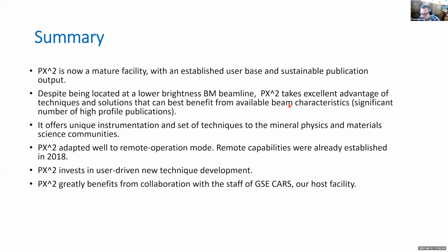It's a great challenge. So if we can reduce the beam size to say 5 microns, it's going to dramatically decrease the complexity of the analysis. This is what is now the case at insertion device experimental stations, and in every case when we produce these multi-grain samples, performing the experiment at Vitaly's insertion device beamline is much easier in terms of interpretation, because you have signal only from maybe 5 crystallites rather than from 50.